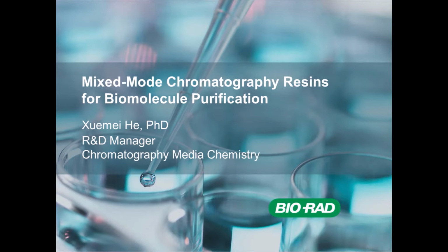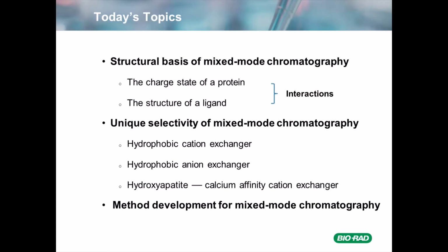Today we are going to talk about mixed-mode chromatography resins for biomolecule purification. First, we will go over the structural basis of mixed-mode chromatography and how the protein charge state and the ligand charge state are impacted by buffer pH and composition, and how we can manipulate their interactions.